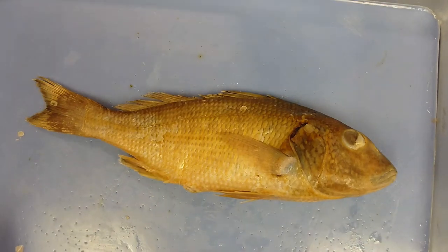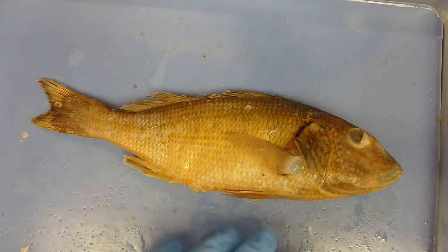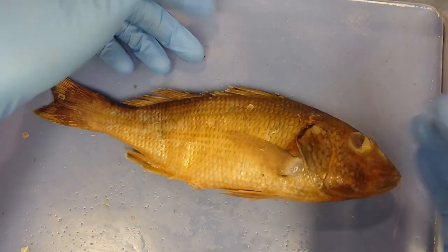I'm going to go through external anatomy before I go through internal anatomy. I'll start off with the fins.